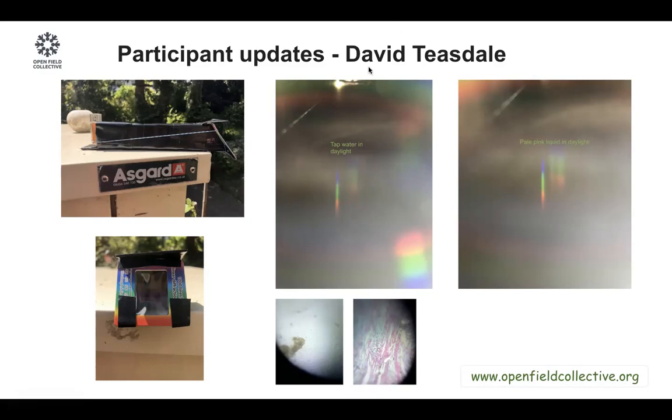Yeah. I think Dennis has a question. How do we filter? There are so many ways. I'm trying to think of one good way that is easier to use. There are various tools in the Foldscope kit. One of the Foldscope boxes that they sell has filtration equipment as well. They sell different kinds of meshes of different sizes, and you can use them to filter something through a cup.